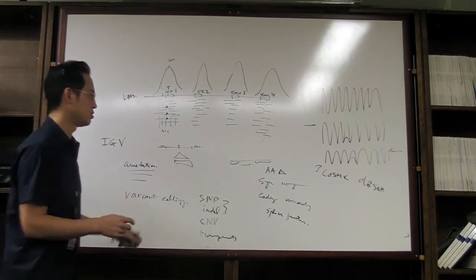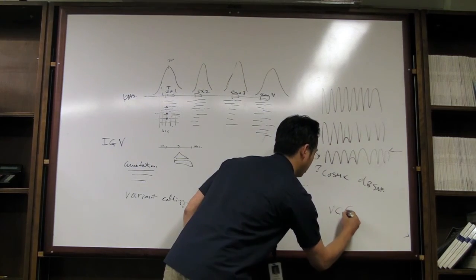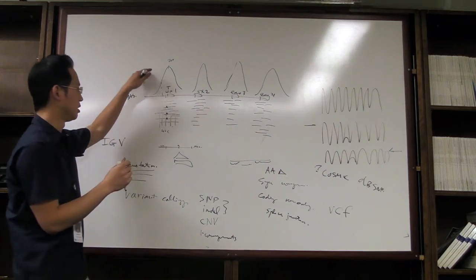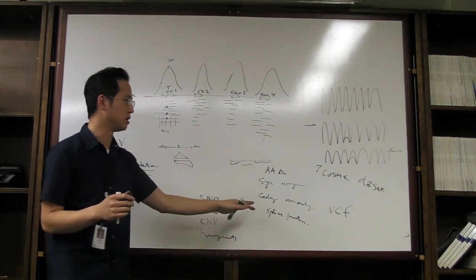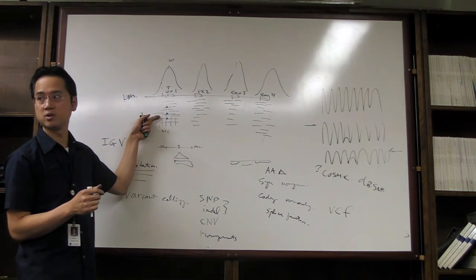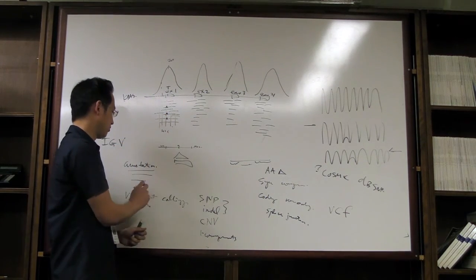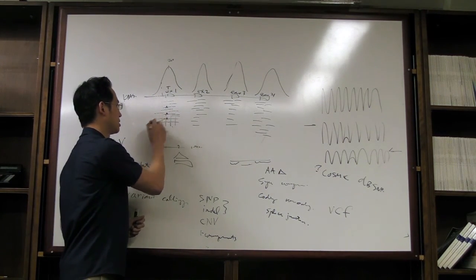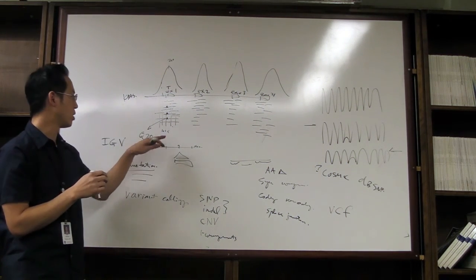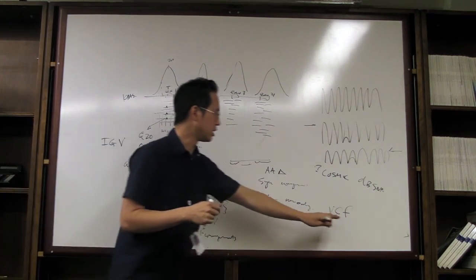So in the end, what you want to do is put all of this together into one file, and that's going to be called the variant call file, or the VCF file. It's a tab-delimited file, tabulated with the genomic coordinates, with all the annotations that you need, the number of reads that cover the reference, the number of reads that cover the mutation, the quality scores. You can build a quality score into here as well. Like, let's say during variant calling, I don't want to call this unless the average quality score is Q20 or Q30. You can set it whatever you want. And that way you can get rid of all of the erroneous reads, etc. So if you do that, you end up with a VCF file.